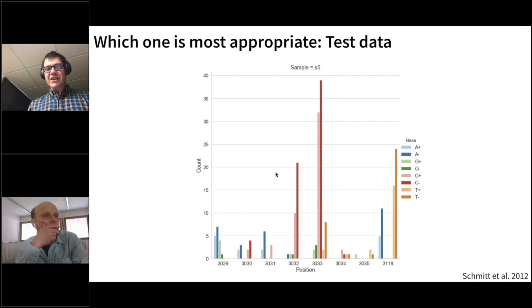So next, what we've decided to do is to apply the three variant callers, Freebayes, Mutect2, and LoFreq to this data to see which one of them will recapitulate that well.